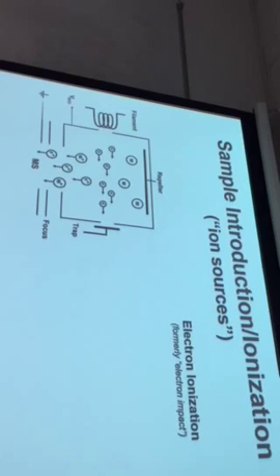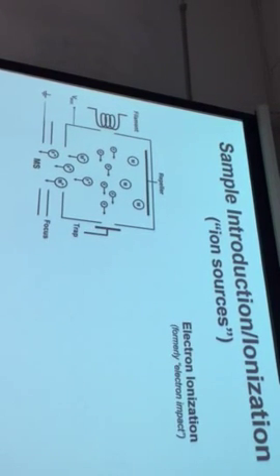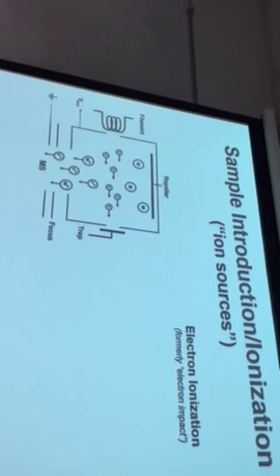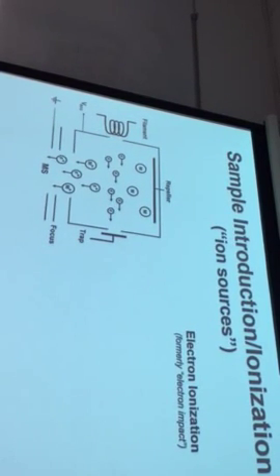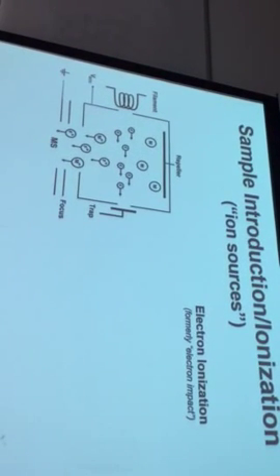because formerly it was thought that there had to be actual collisions between the electrons in the electron ionization source and the analyte molecules in order for the process to take place. But nowadays, the widely accepted theory is that that contact is not necessarily required.